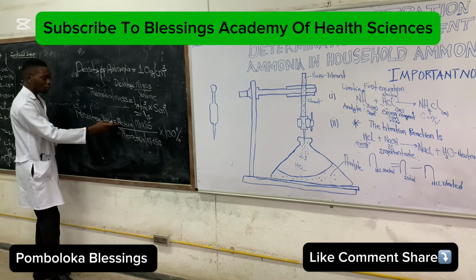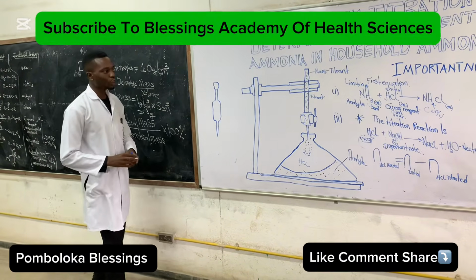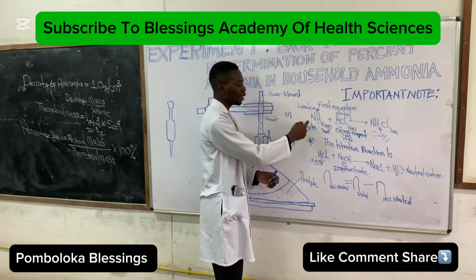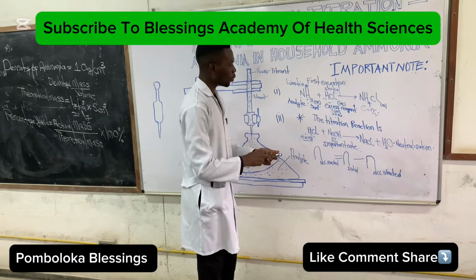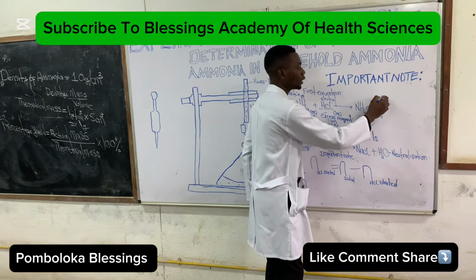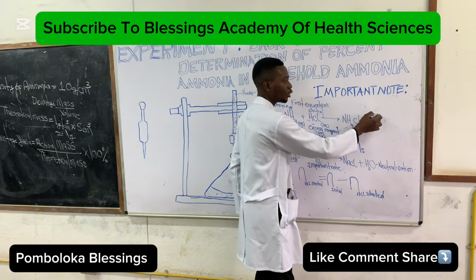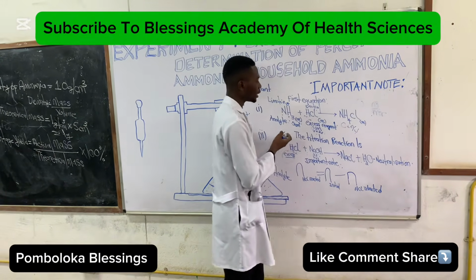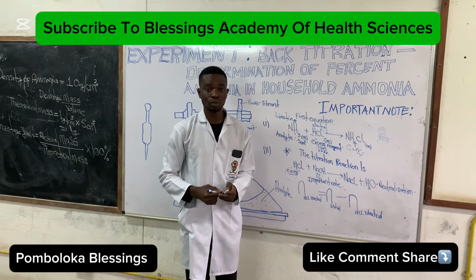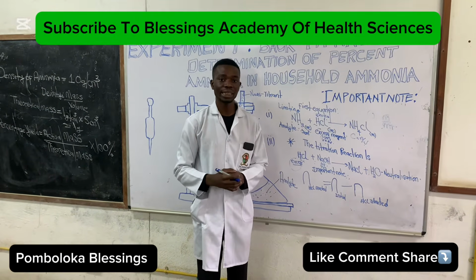And then the actual mass of the ammonia, you are going to work out throughout the entire course of the reaction, because you now know the moles of the hydrochloric acid that were reacting with the moles of the ammonia. You're going to find the exact moles, and when you know the moles, you can find the mass because you know number of moles is given by mass over molar mass. We know the moles, we're trying to find the mass, then the molar mass. So you're going to find the exact moles of the ammonia that were reacting in the first part of the reaction. So now this is the basic principle that lies in back titration.